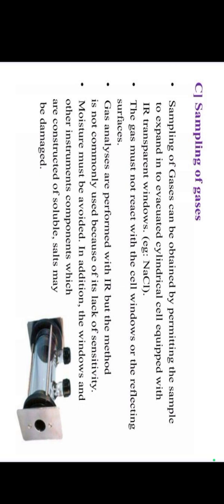Moisture must be avoided in the sampling of gas. The windows and other instrument components which are constructed of soluble salts may be damaged. These are the sampling techniques we use in IR spectroscopy.